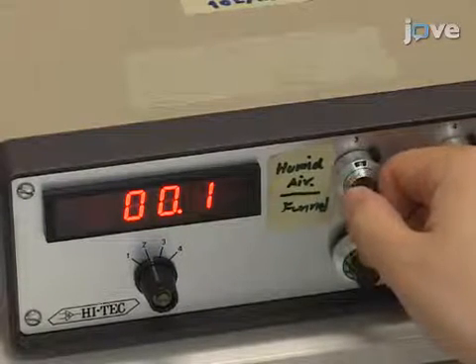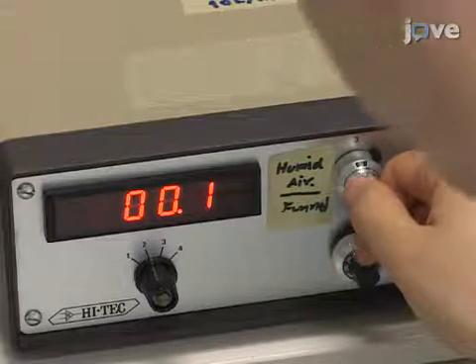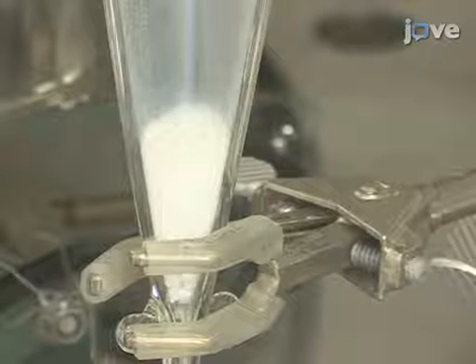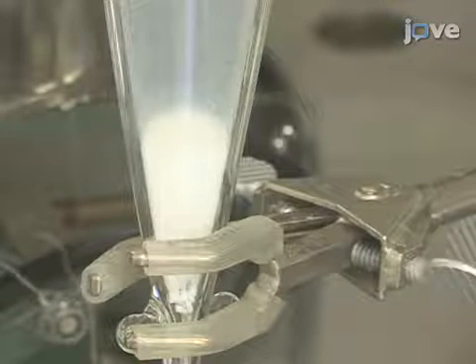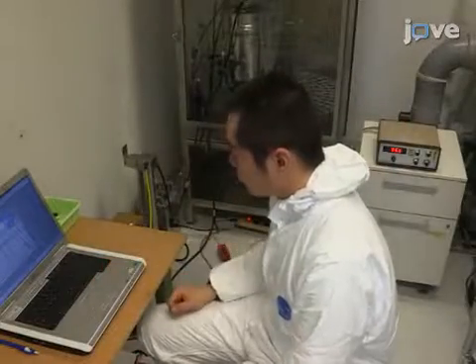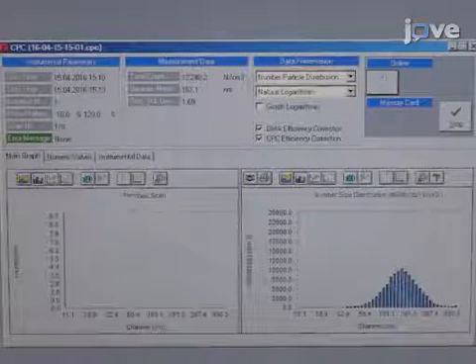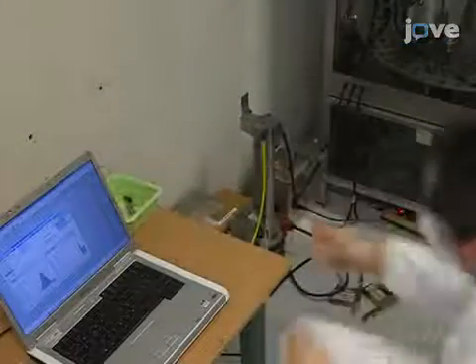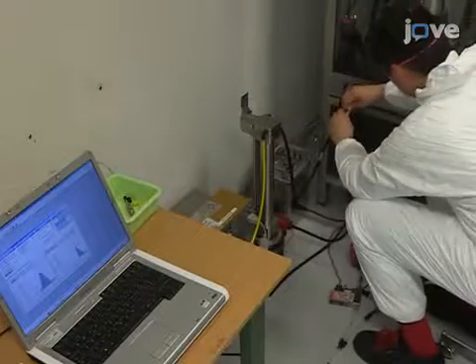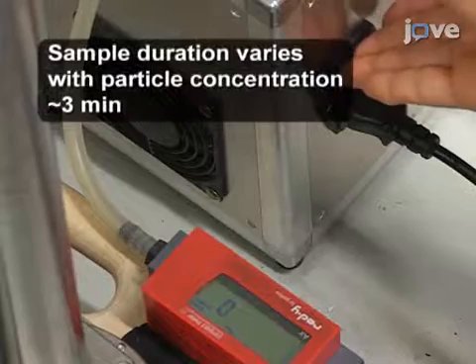Slowly increase the aerosolization flow rate from 0 to 0.3 to 0.5 liters per minute. Visually confirm the desired level of aerosolization by monitoring the powder in the generator. Increase the flow rate very slowly using the tuner while monitoring the powder movement closely, and immediately stop increasing once the desired level is achieved. Move on to start the dilution flow, slowly increasing it from 0 to 2 liters per minute. As both flows start, begin measurements with the optical particle counter and scanning mobility particle sizer. Once aerosolization is stable, turn on the pump connected to the transmission electron microscopy sampler at a flow rate of 0.3 liters per minute.